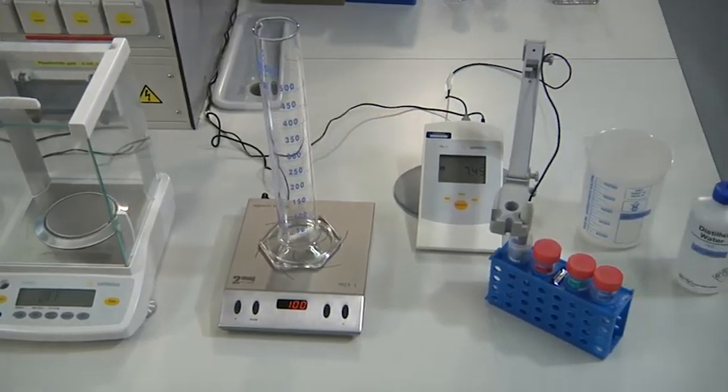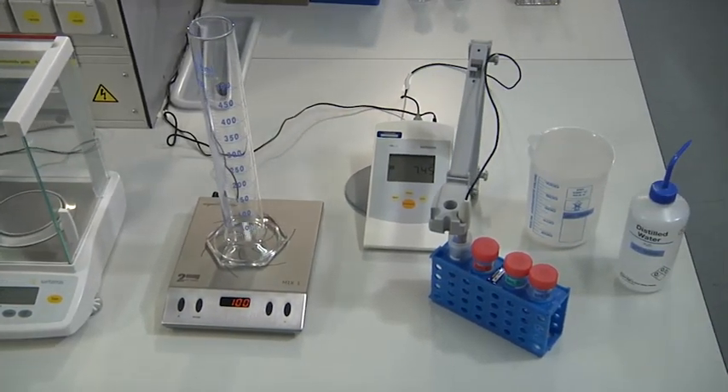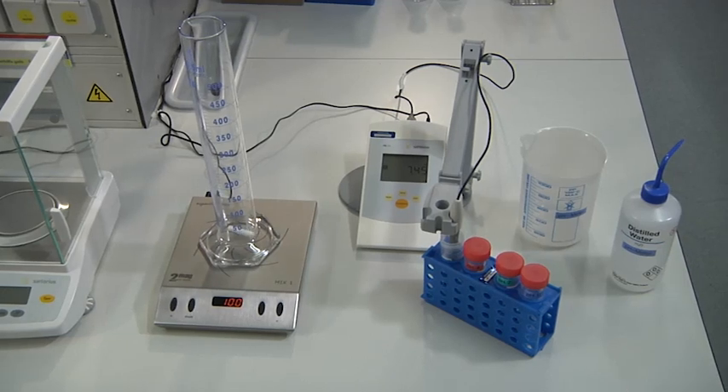Additionally, we need a magnetic stirrer, a pH meter, and solutions of an acid and a base for titration.